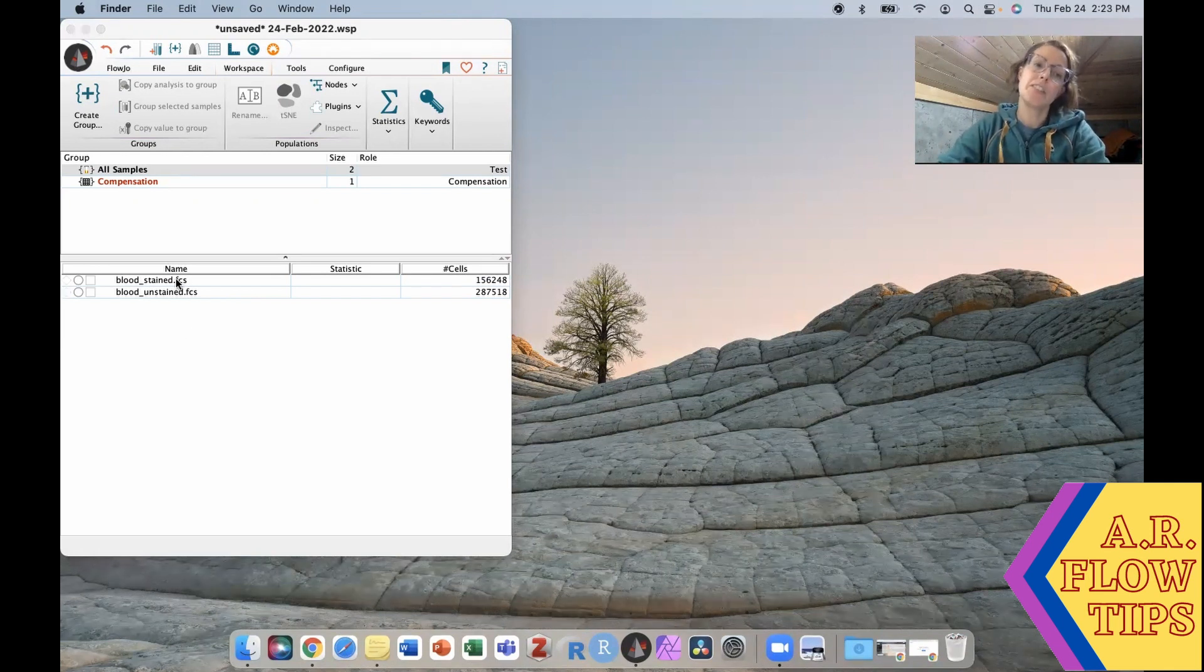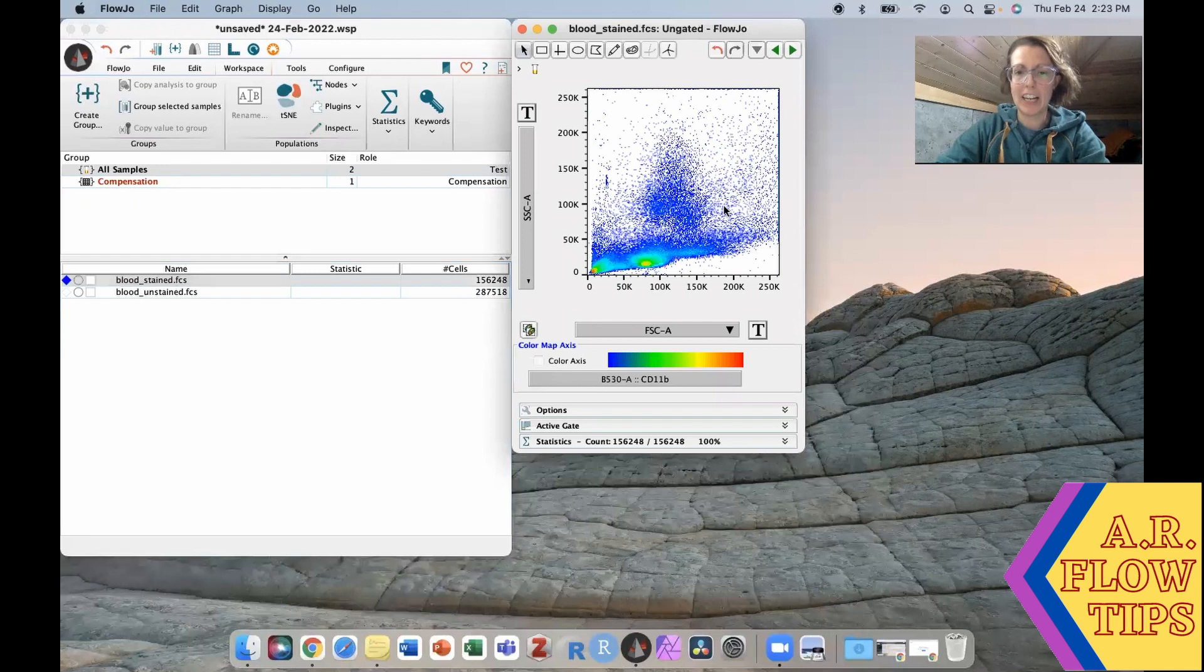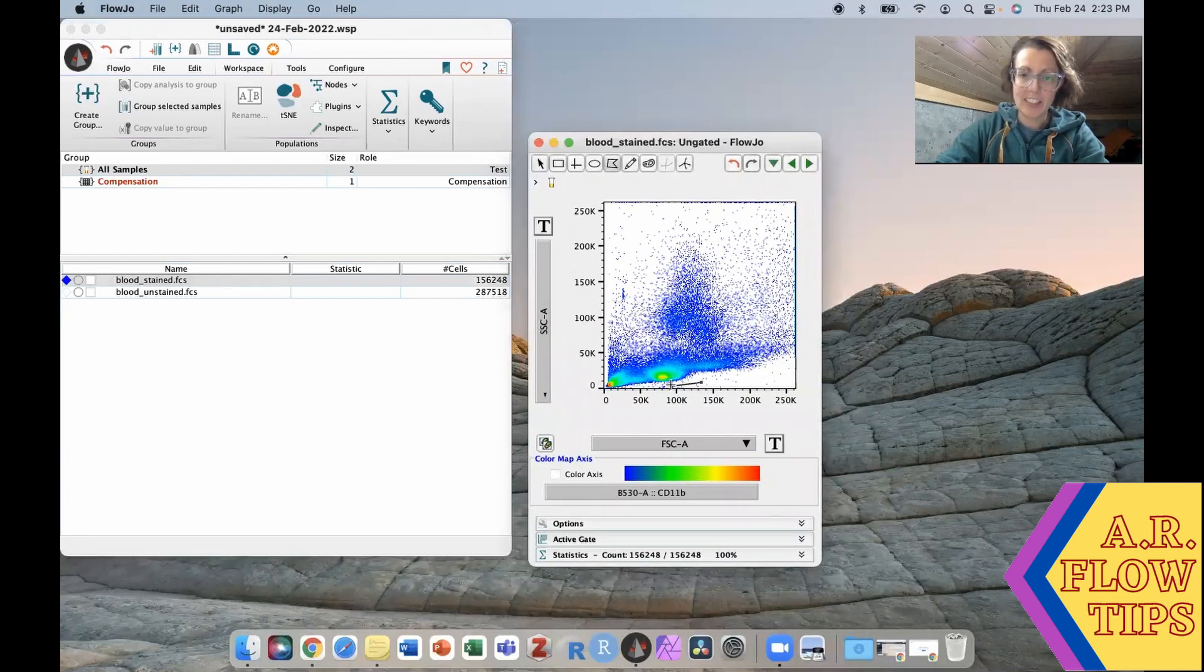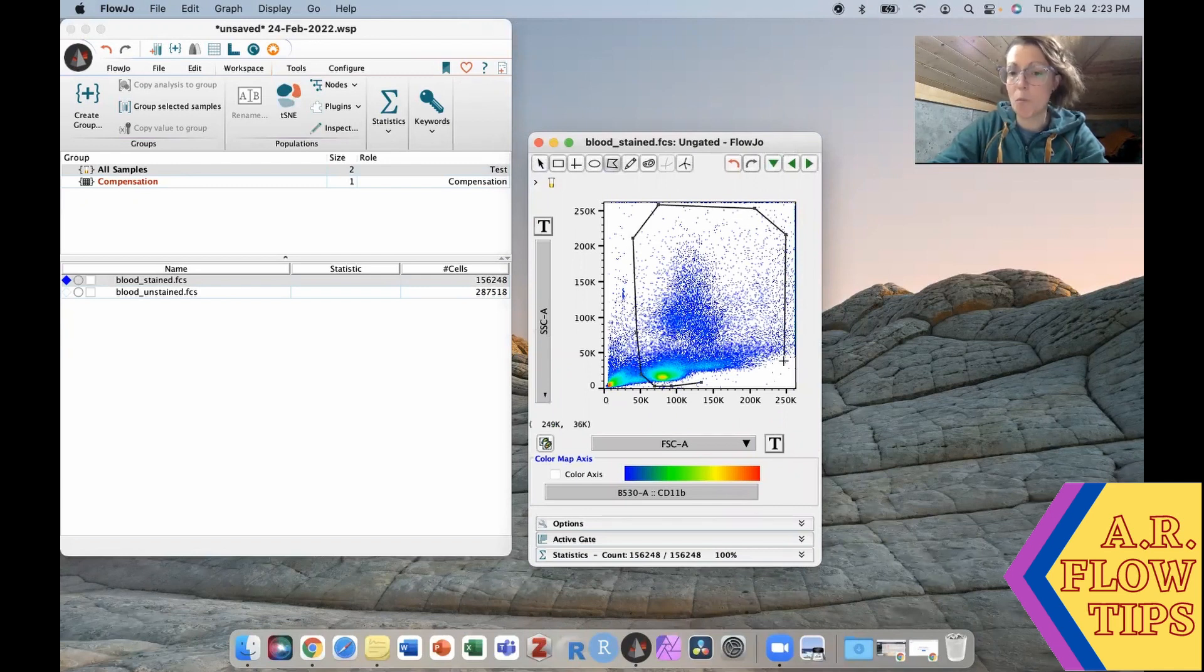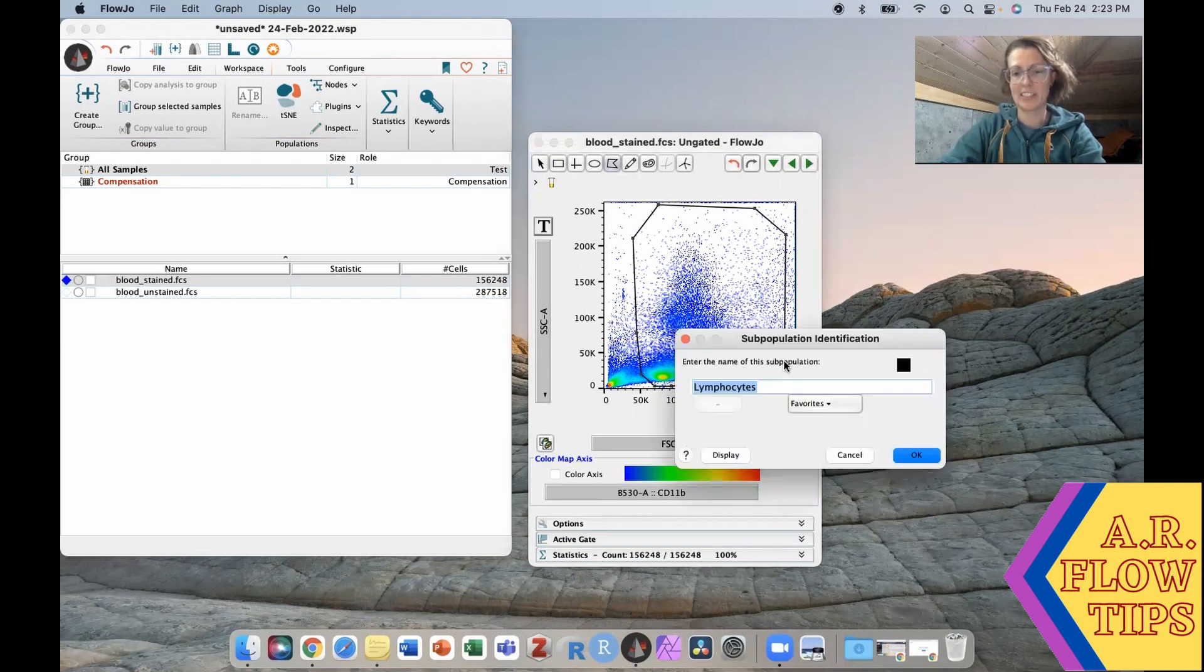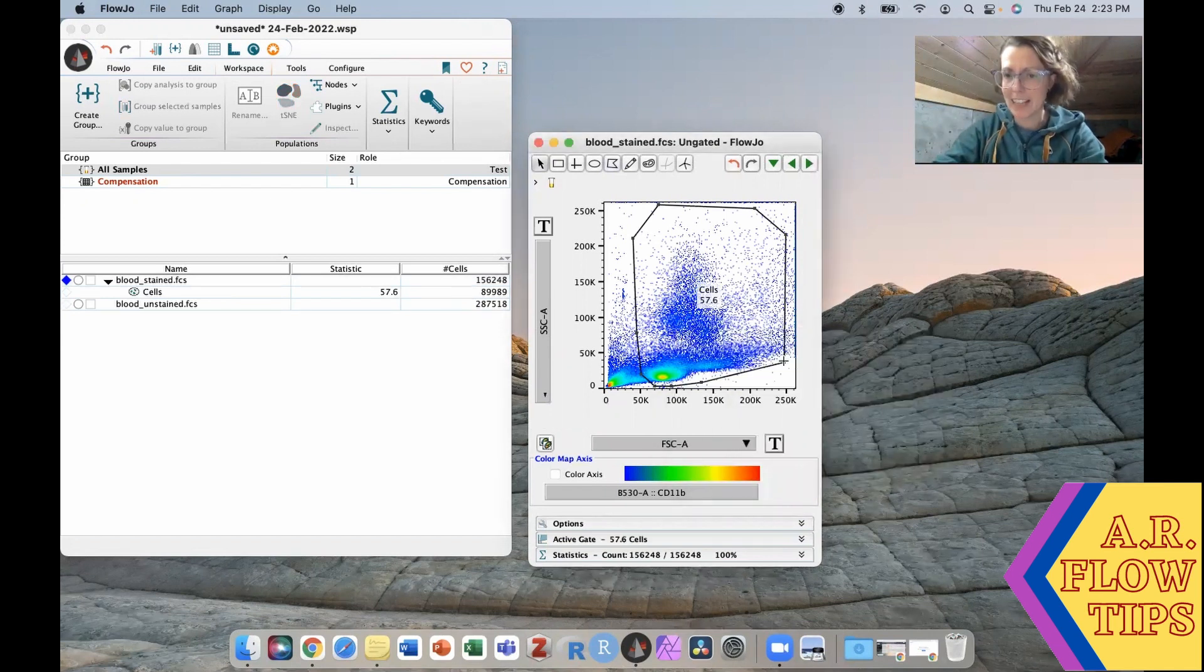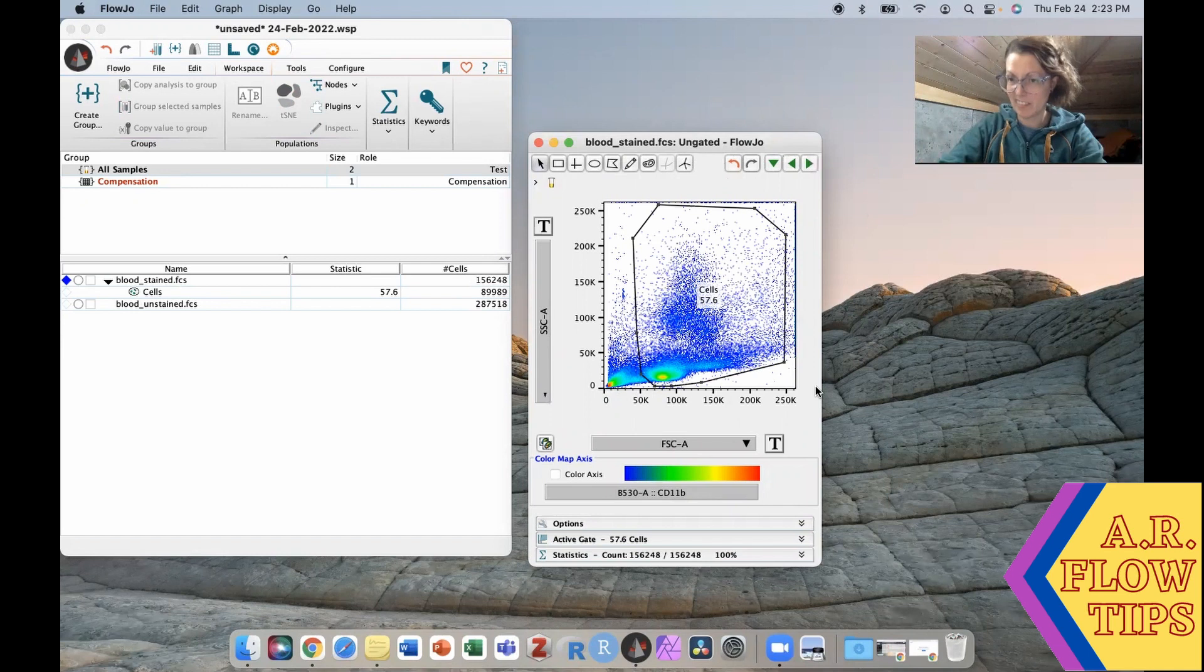The first thing I would do is open the data file and do a basic forward scatter side scatter gate so I can get rid of the debris, the clumps, and the really obvious stuff that I don't want to analyze. I'm not fine tuning into the exact population I want to look at, just a broad gate so I can get rid of the debris, clumps, things I don't need.